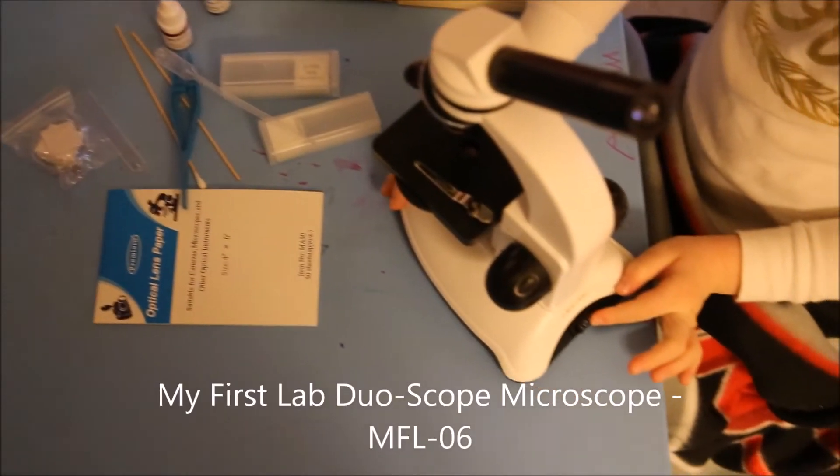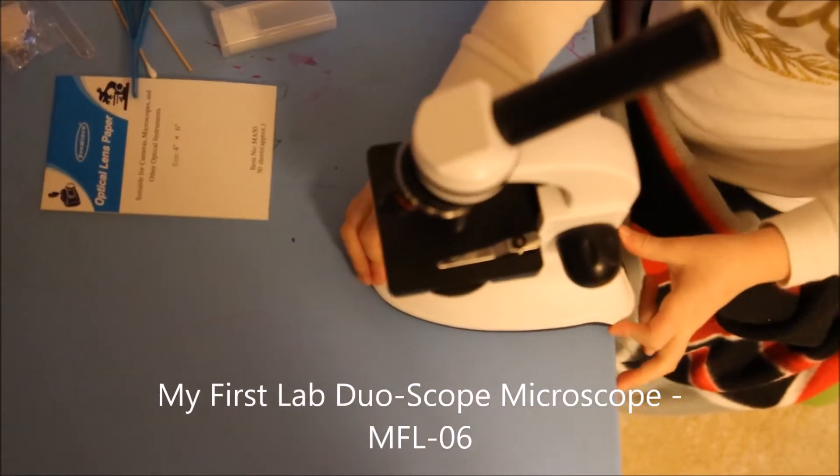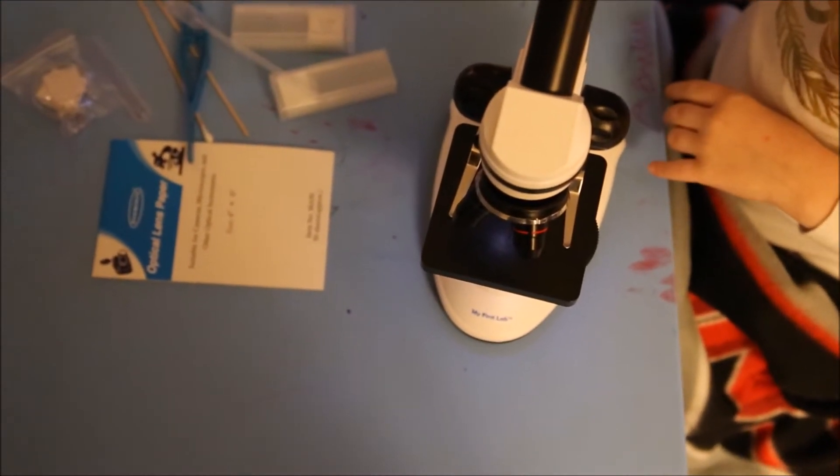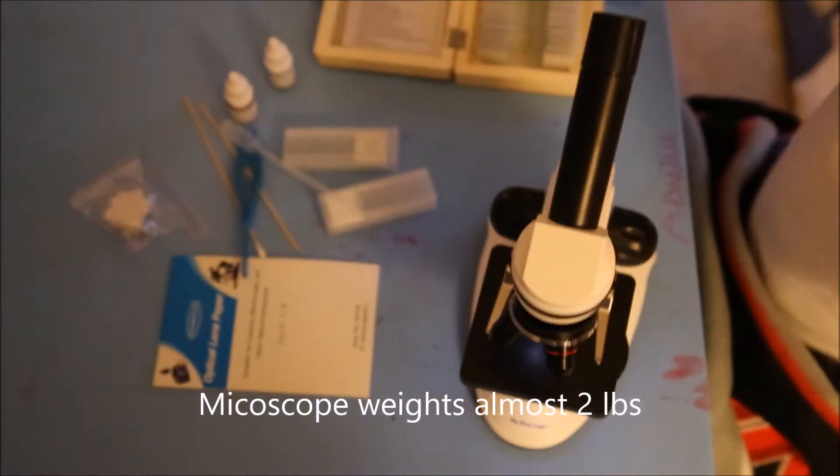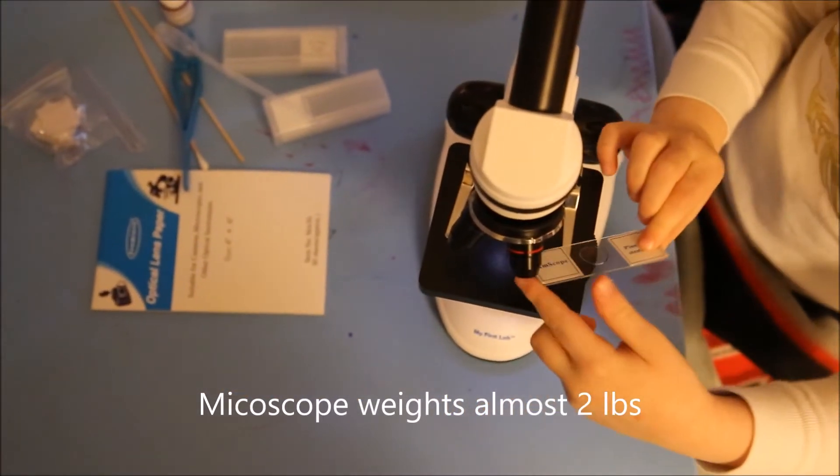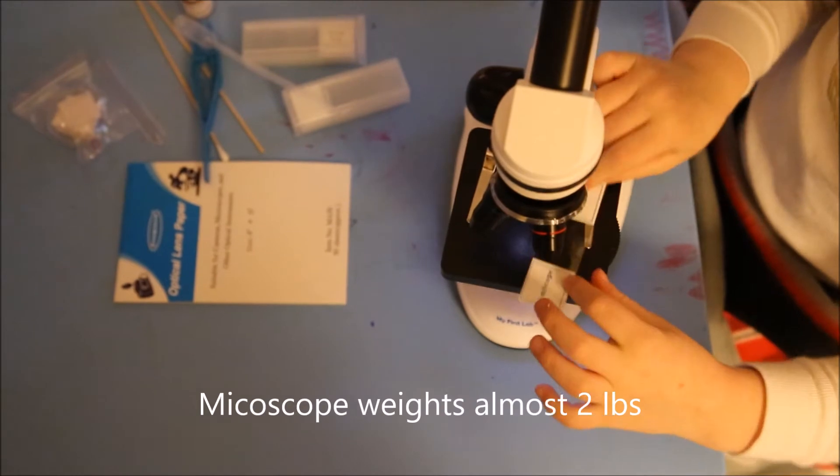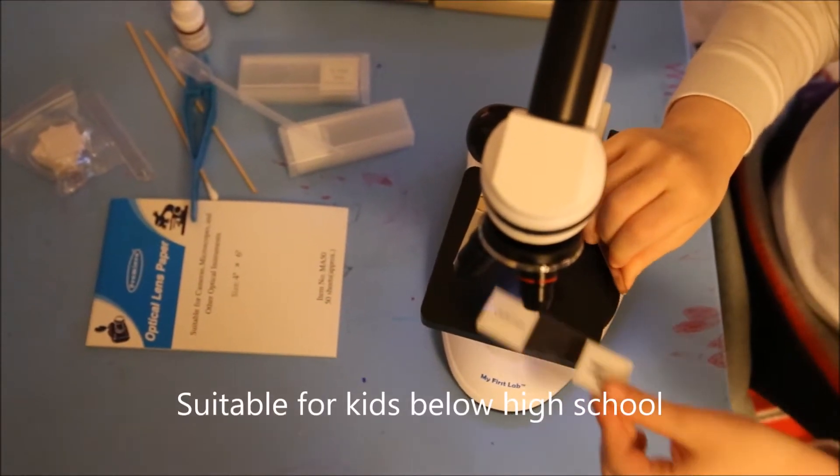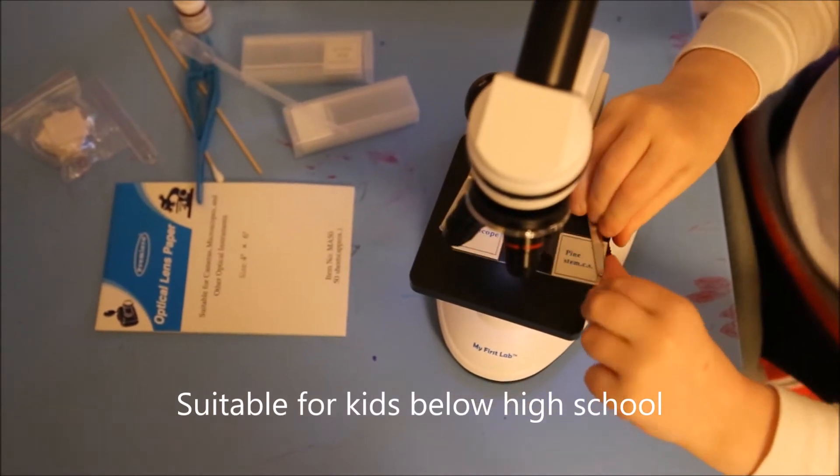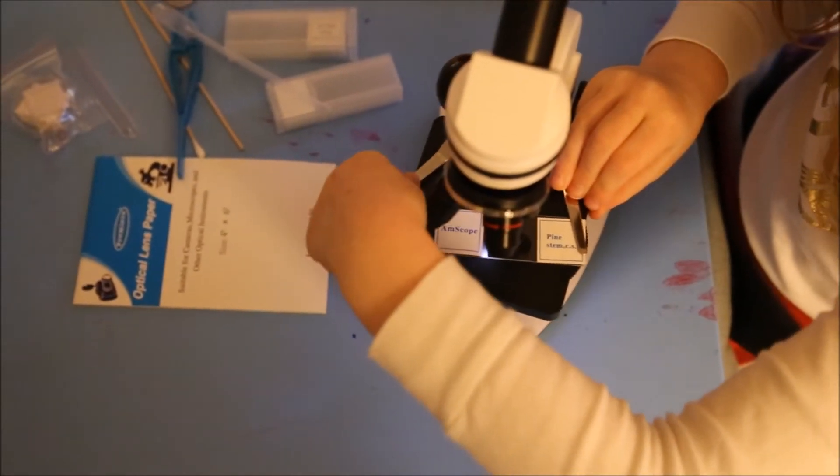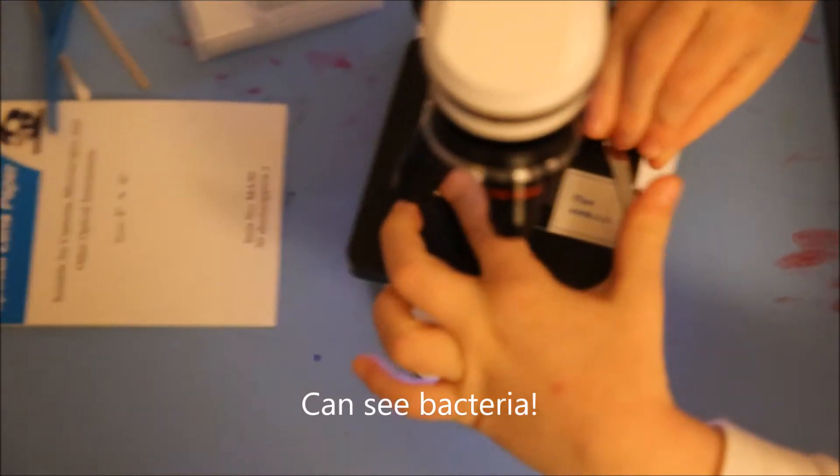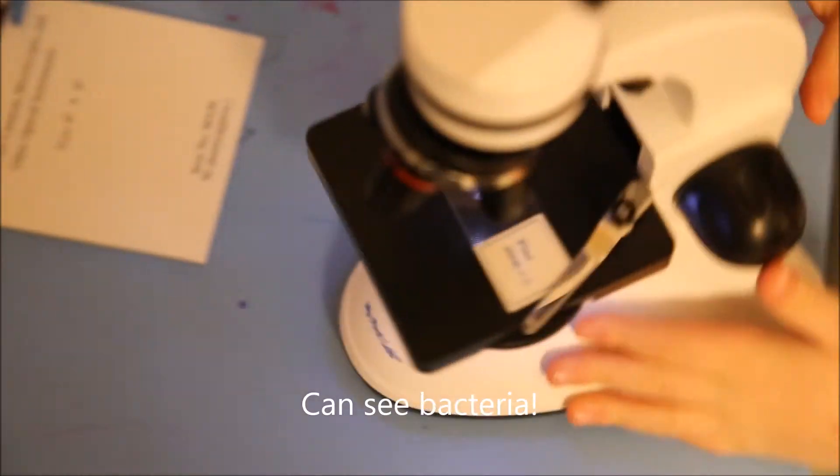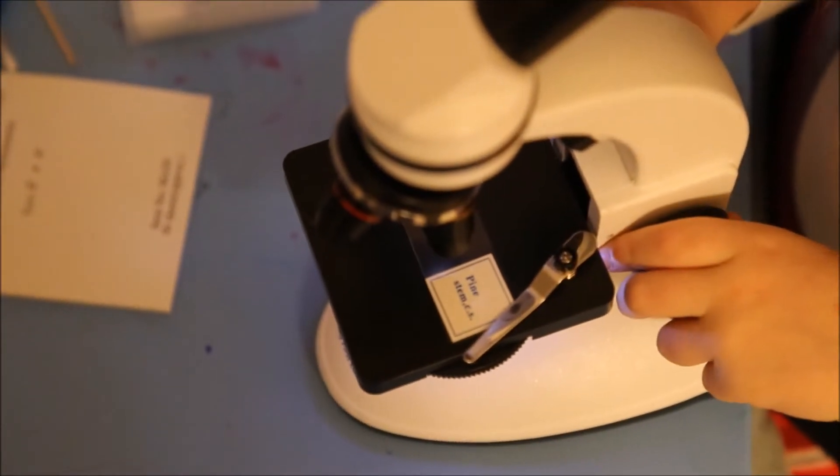So right here is the light, and here is the little stuff that I put them in. Then you look into it.